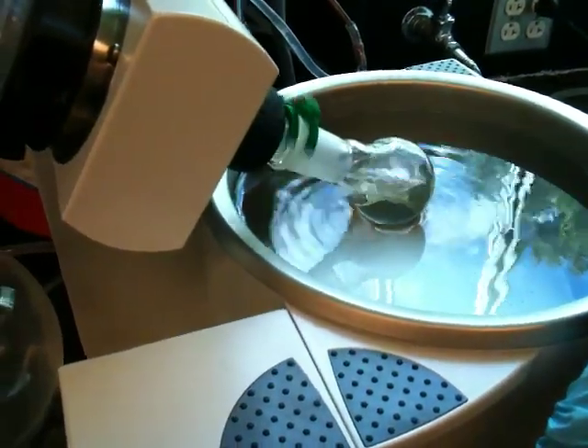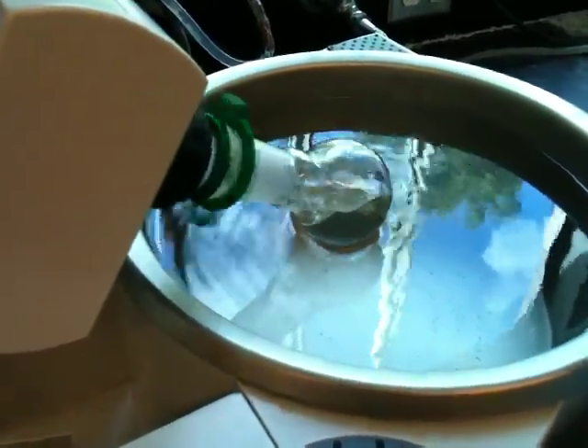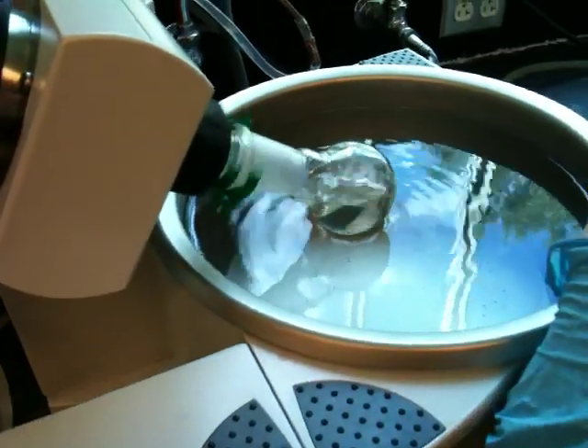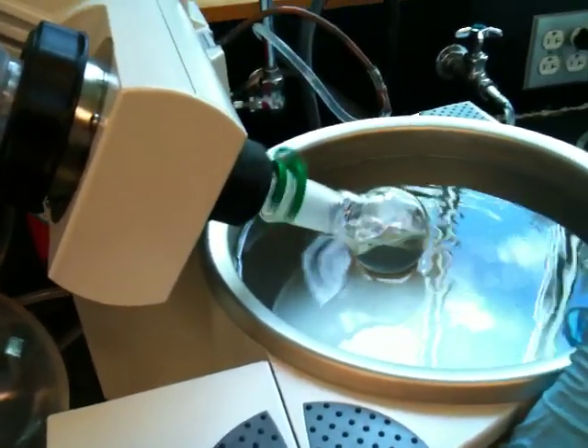You should think about how long it takes you to do a distillation — distillations often take 40 minutes before you really get them heating. So hopefully this will help you a little bit when you're in lab, but of course we will help you set up when you get here, and we'll go over it again.